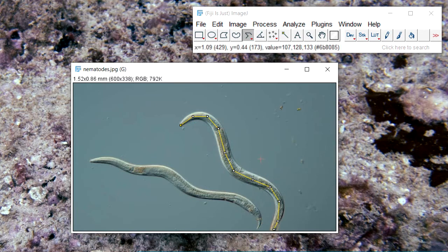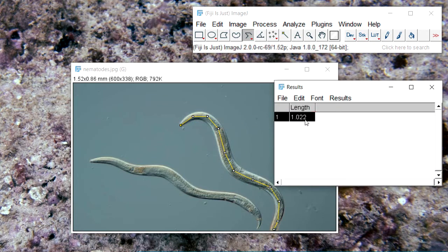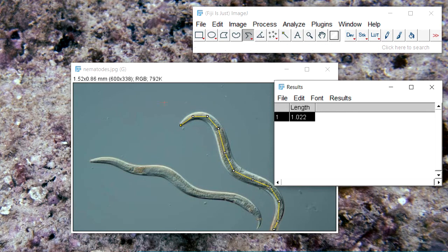From here you press Ctrl and M at the same time and that will give you the measurement. You can then export or copy it into an Excel file, and you can do it for all the nematodes and new files. There you go.